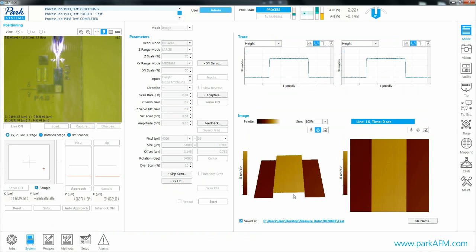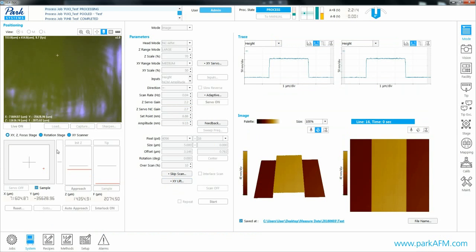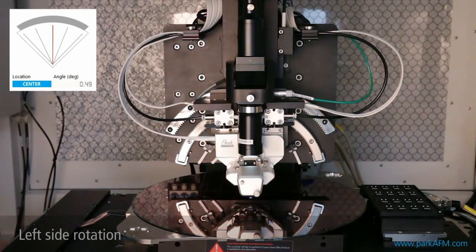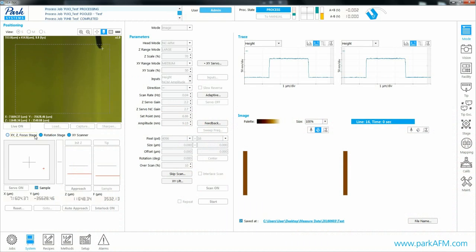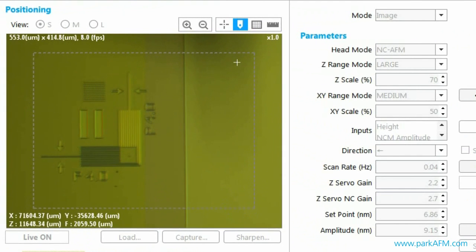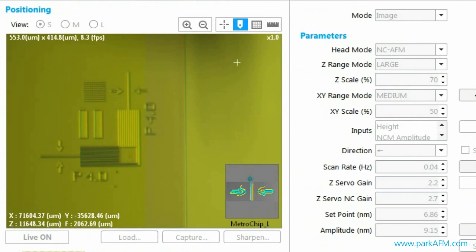PARC-NX3DM features a rotating head which turns to measure a sample's 3D structures, such as sidewalls. The head first rotates to measure the left sidewall. The area specified in the recipe is targeted and scanning begins.